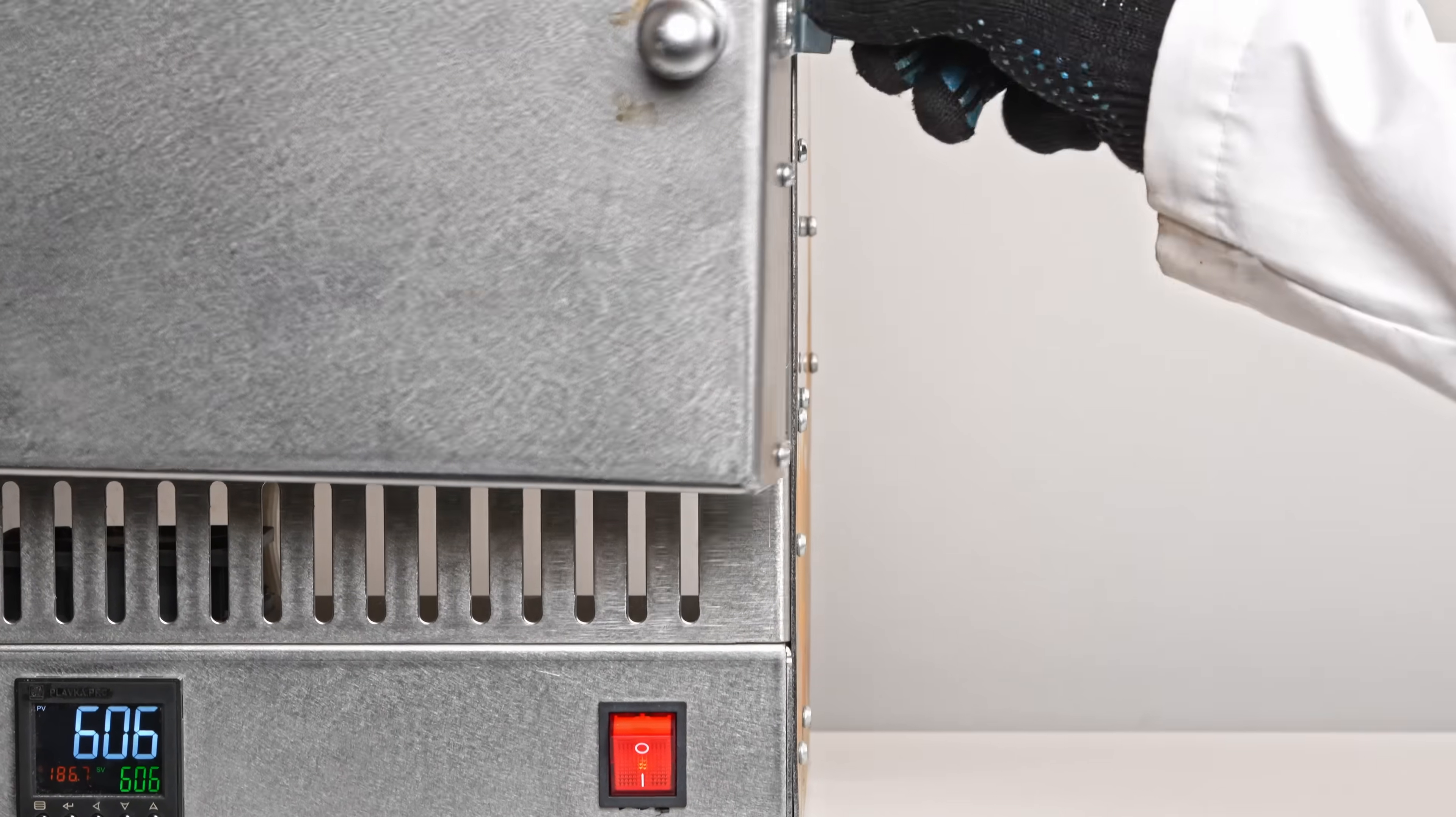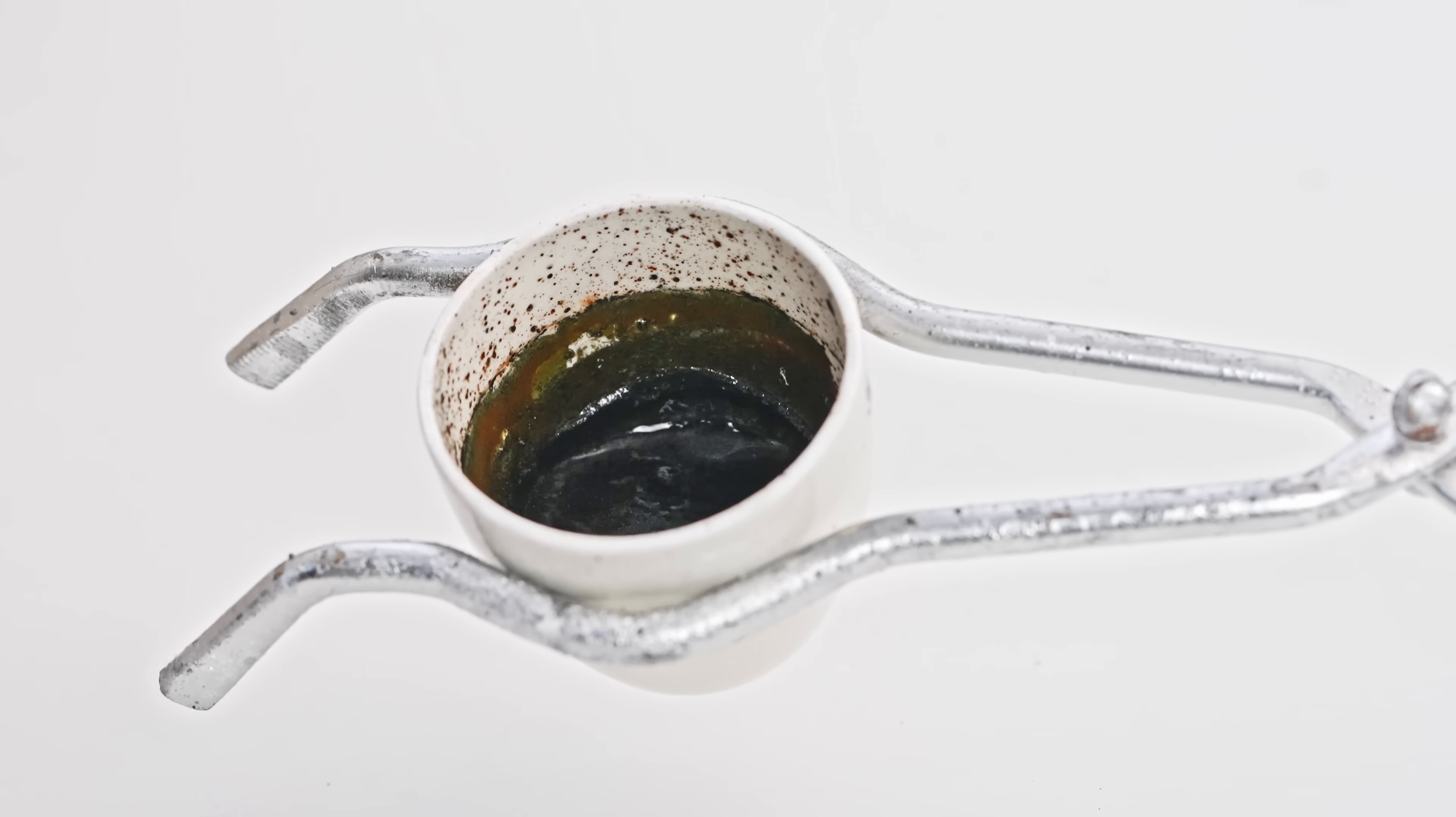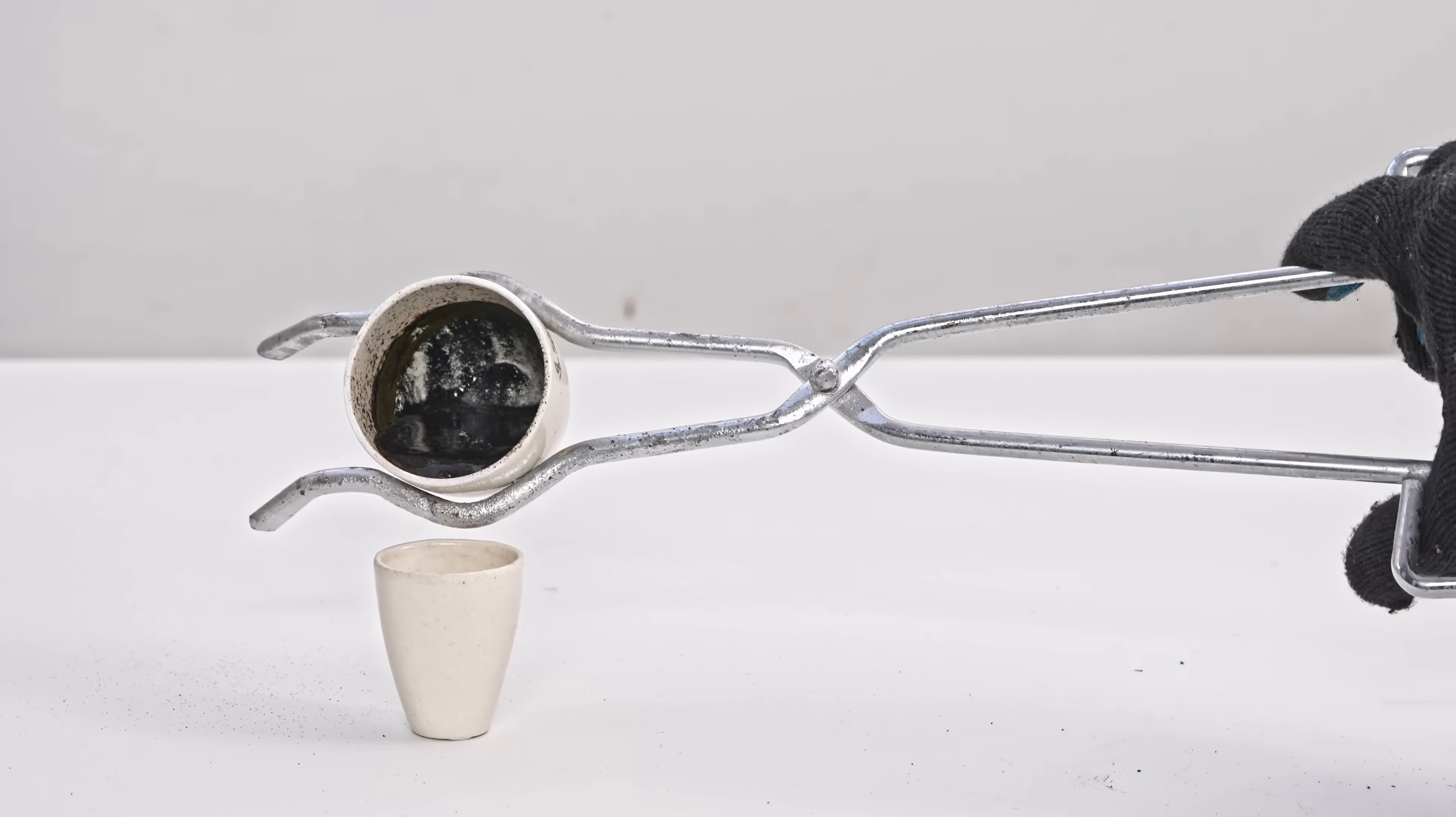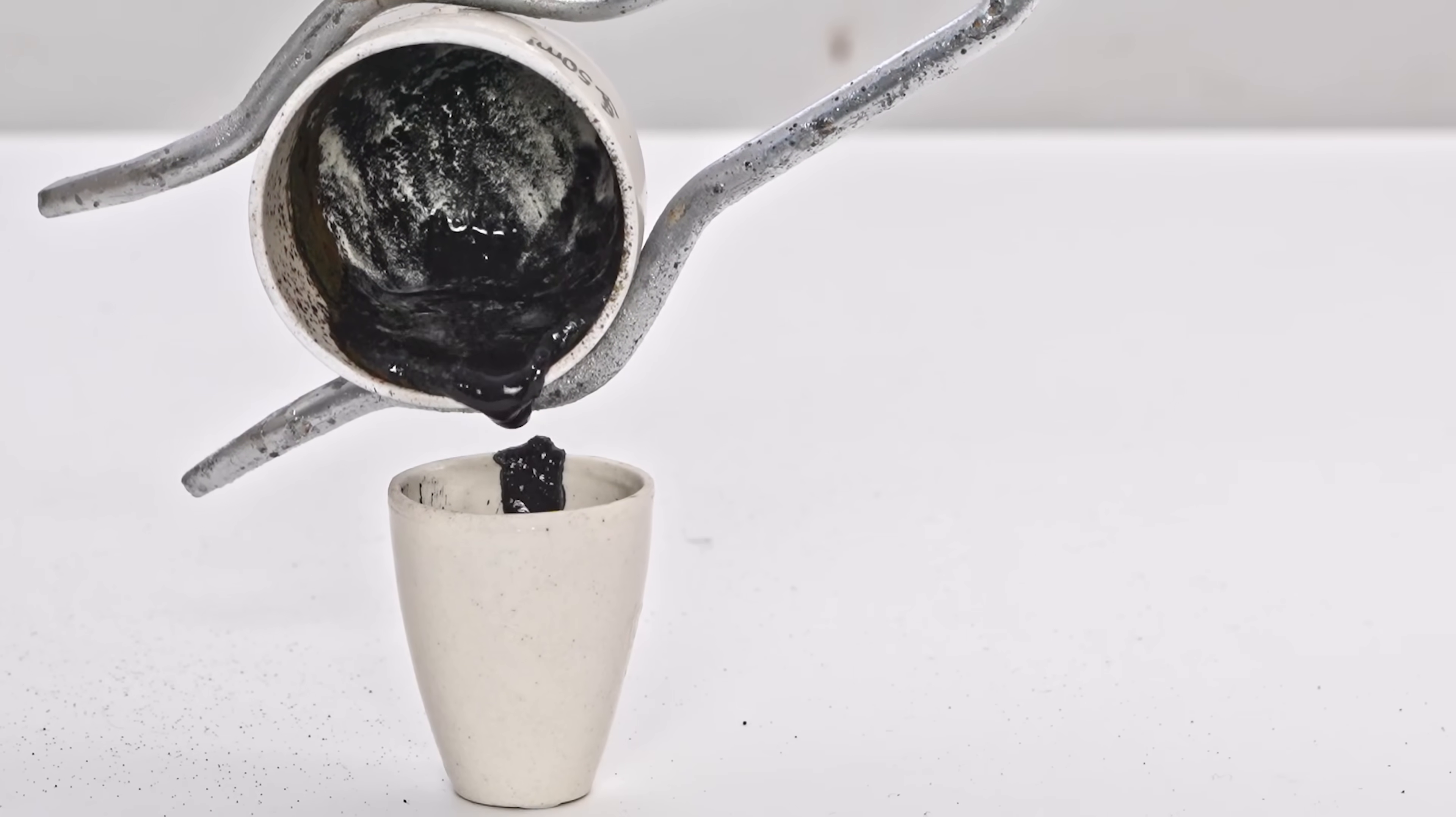After the reaction was complete, which can be determined by the absence of gas bubbles from the melt, I took the melt out of the muffle furnace and poured it into another crucible. The black color in the melt comes from elemental iron, a by-product from the reaction.